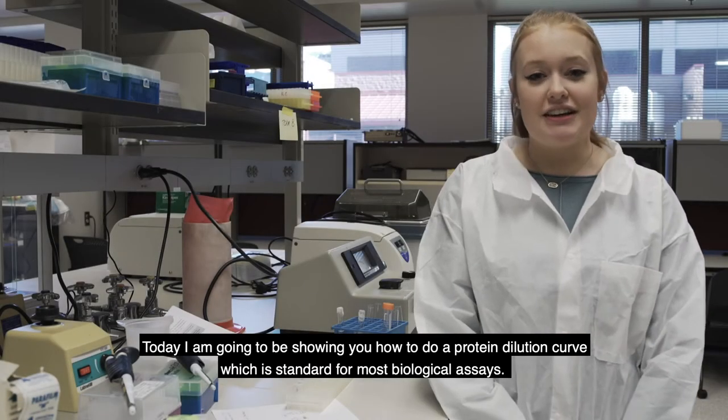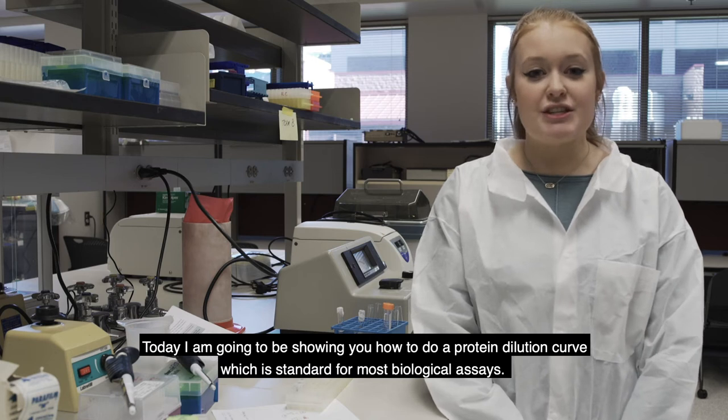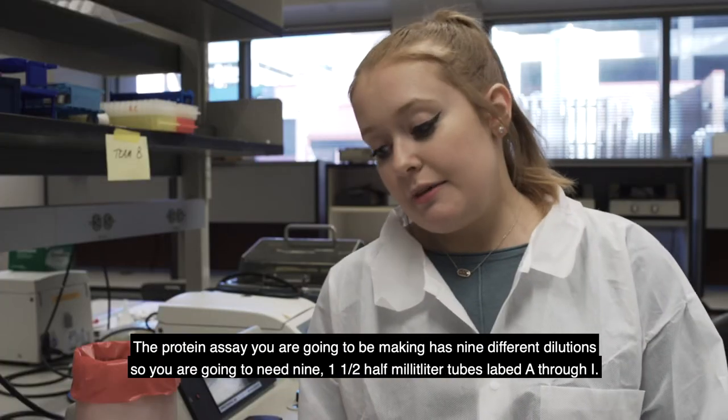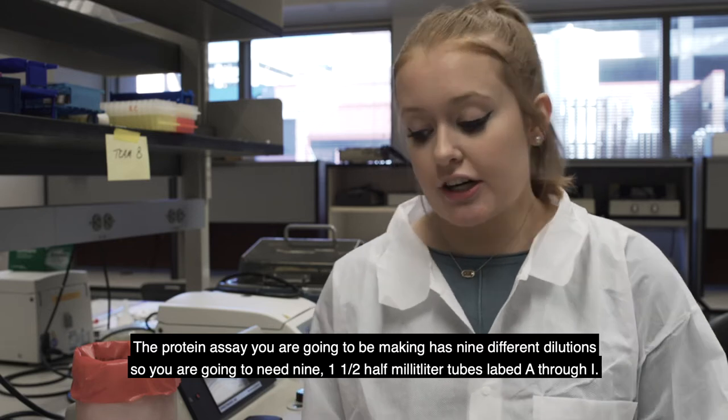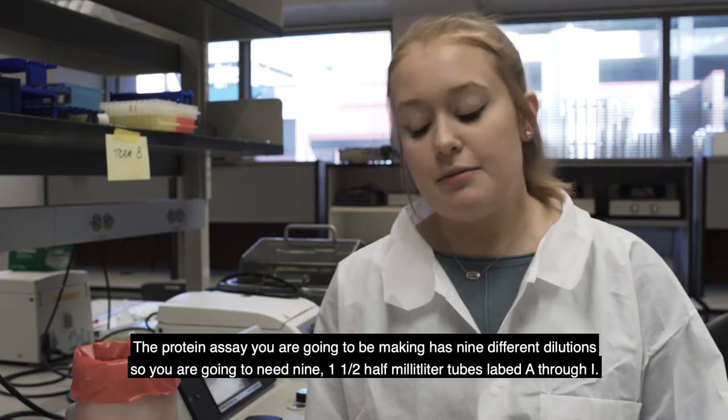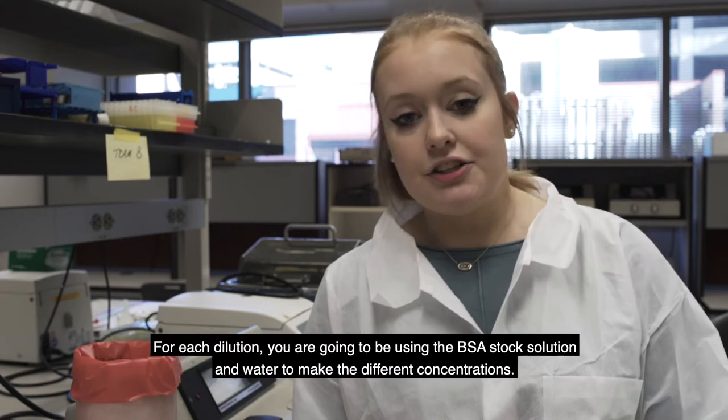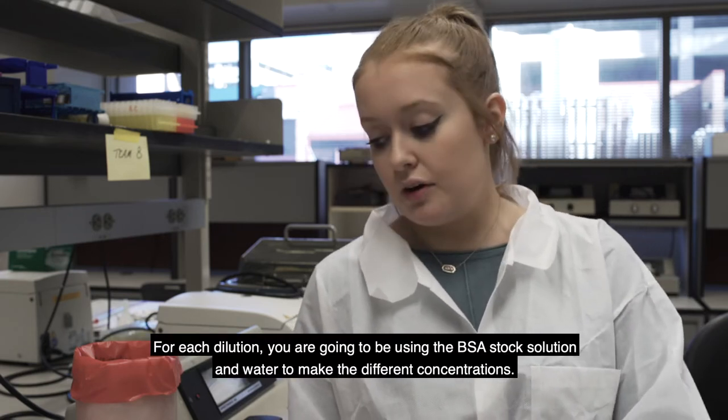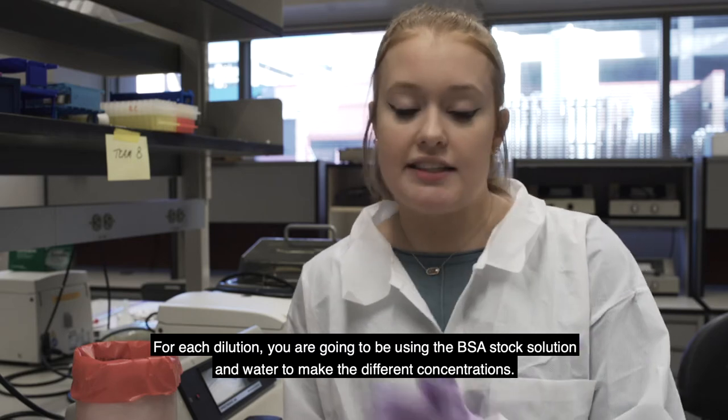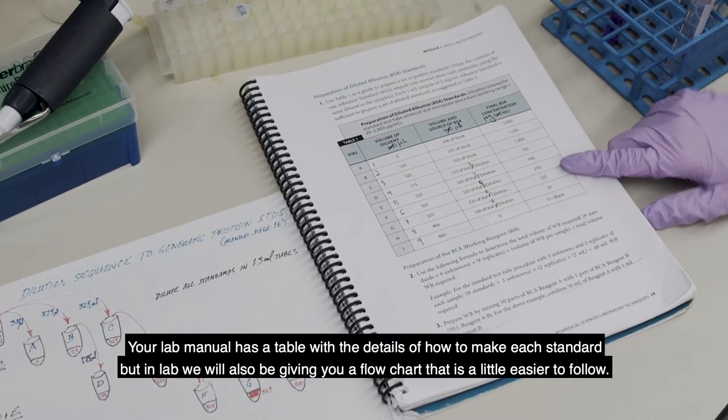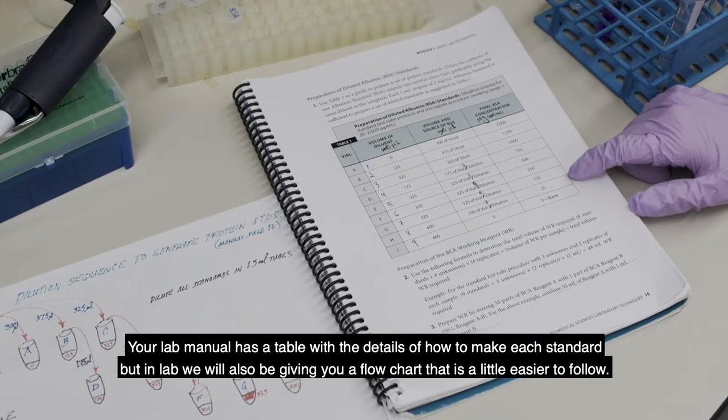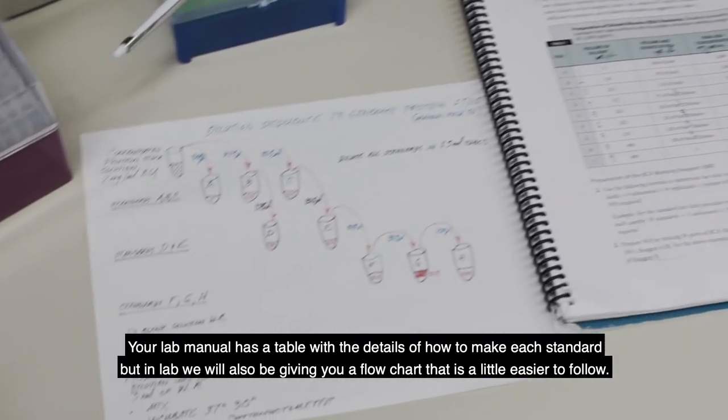Today I'm going to be showing you how to do a protein dilution curve, which is the standard for most biological assays. The protein assay, you're going to be making nine different dilutions. So you're going to need nine, one and a half milliliter tubes labeled A through I. For each dilution, you're going to be using the BSA stock solution and then water to make the different concentrations. The lab manual has a table with the details of how to make each standard, but in lab, we'll also be giving you a flow chart that's a little bit easier to follow.